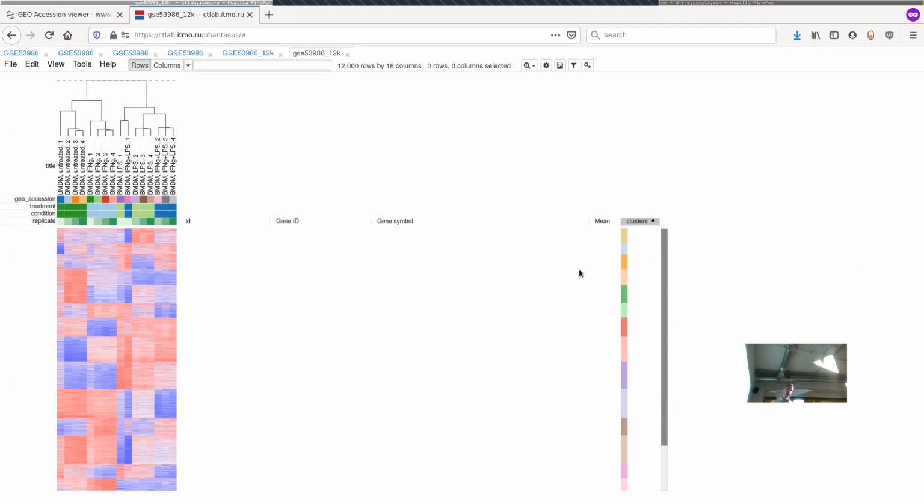That will be our intermediate cluster. Next it tries to find what it can join next, the next closest part. What it results in is a branch length: the shorter it is, the more similar the samples or the clusters are, and the longer, the more different.